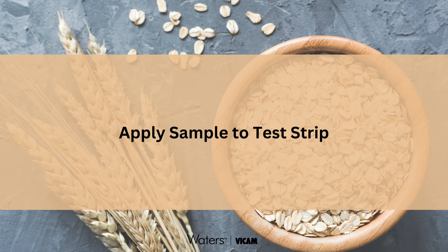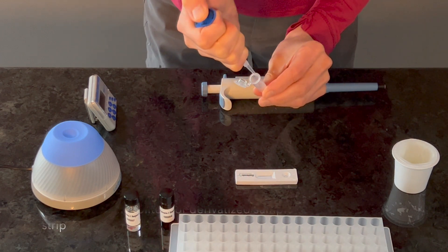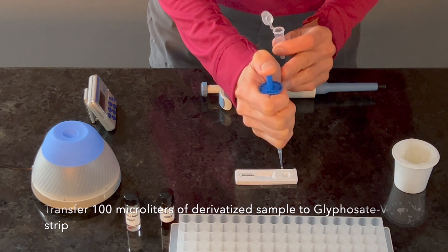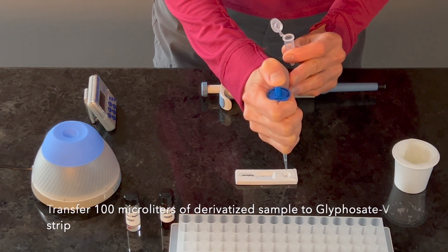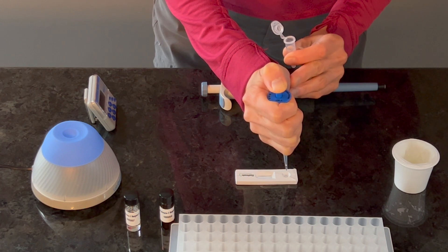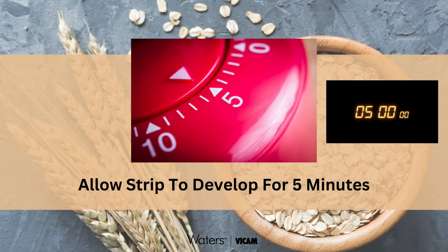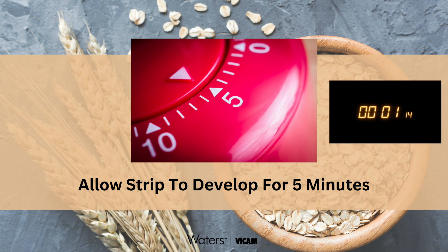Transfer 100 microliters of derivatized sample to the glyphosate V strip by pipetting vertically into the round sample opening, allowing the sample to flow at a rate of about one drop per second. Be sure to transfer all of the sample from the pipette tip to the strip. Set a timer for 5 minutes, allowing the strip to develop on a flat surface.